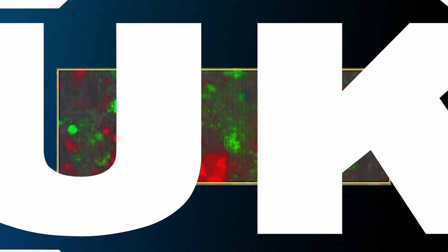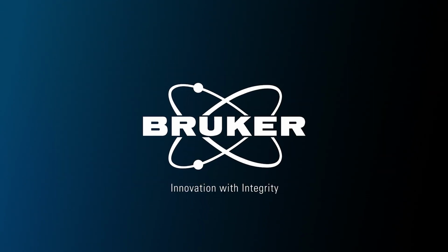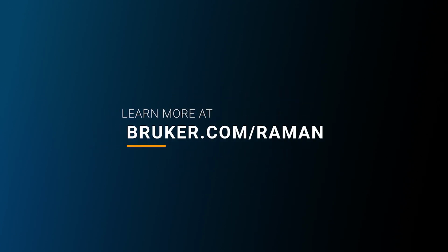Especially for inorganics, Raman is an incredibly valuable tool and can detect many additives and fillers within a polymer matrix.